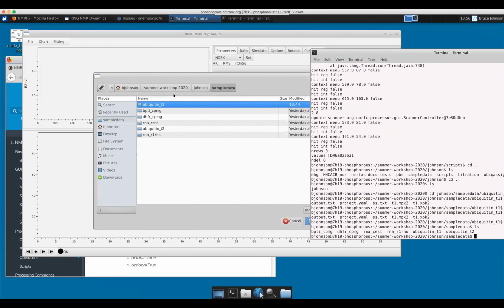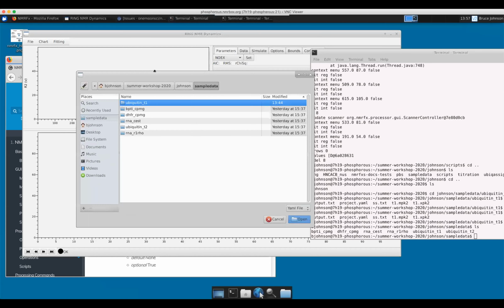You know, I gave the demo just the other day, a quick one, to Andy and some of his colleagues, and they got back to him with some data right away. And there was an issue at reading it in. It turned out fairly trivial to fix, but there are so many different ways of storing the data that I'm sure you will find some data that we need to tweak a little bit. So let's go find the BPTI.